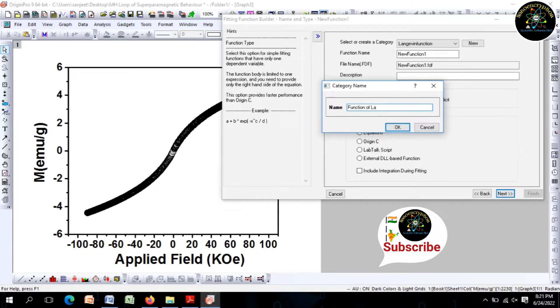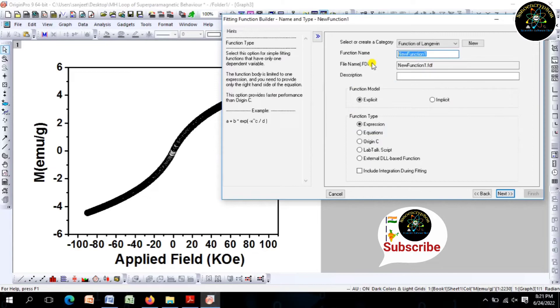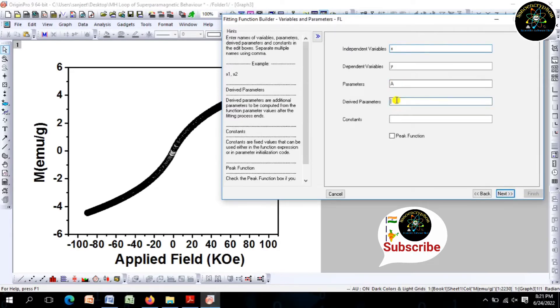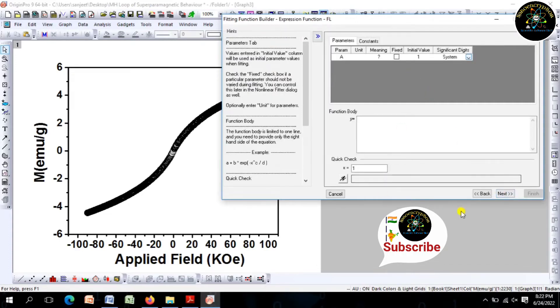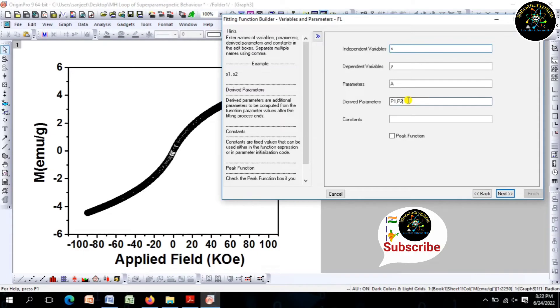Such as lens beam function, which I have put here. Then after, rename parameters like P1, P2. After that, write the lens bin function in the function body, as I have mentioned here in the function body.